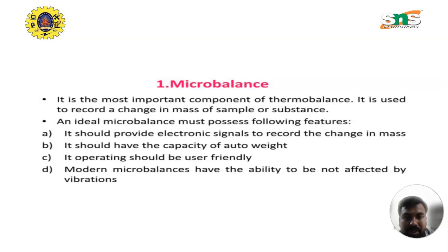The first one is the microbalance. It is the most important component of thermobalance. It is used to record a change in mass of sample or substance. So it is used to record the change in mass of some sample.